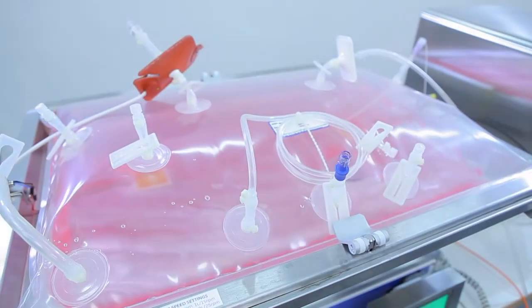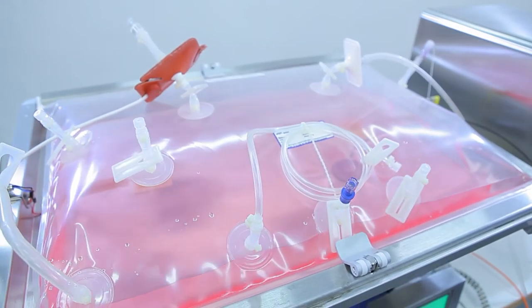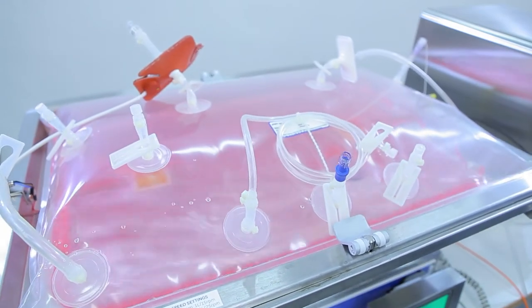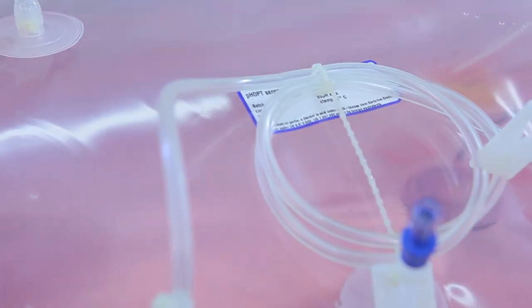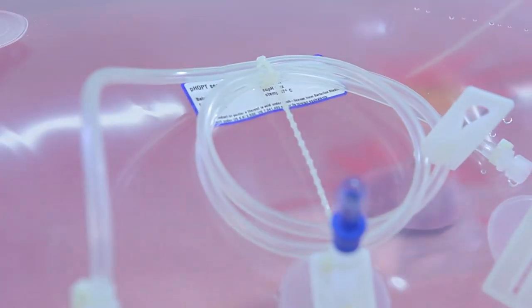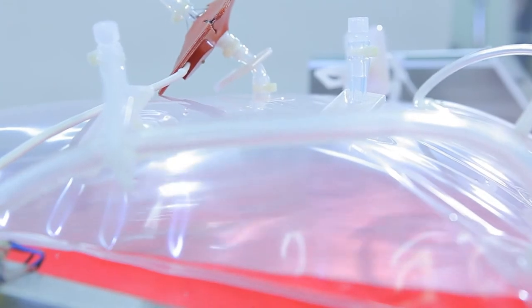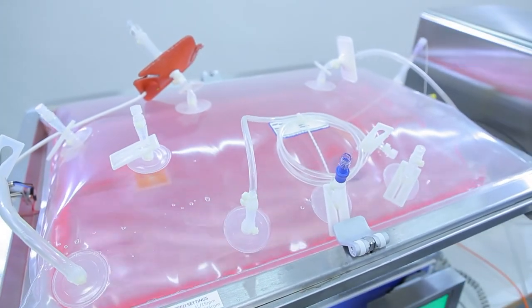Allow the cell bag bioreactor to equilibrate. During equilibration, the medium reaches the operating temperature and pH. The cell bag bioreactor reaches the correct pressure and gas composition, and the carbon dioxide concentration in the headspace. And the medium is equilibrated.